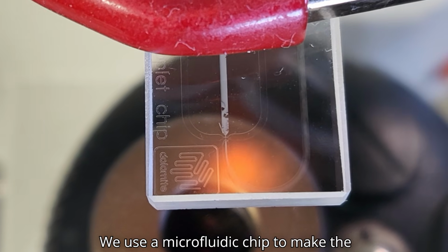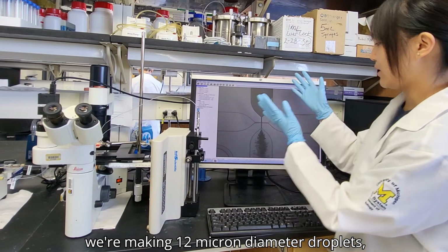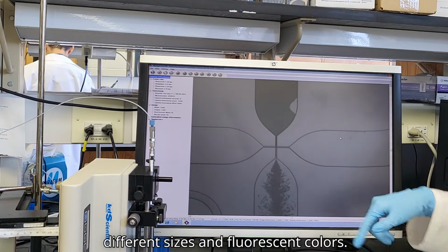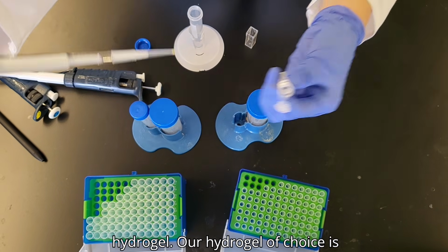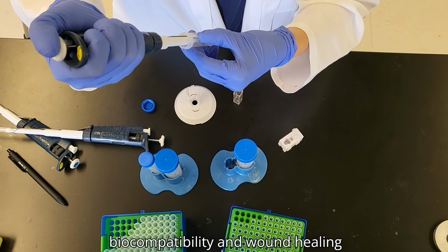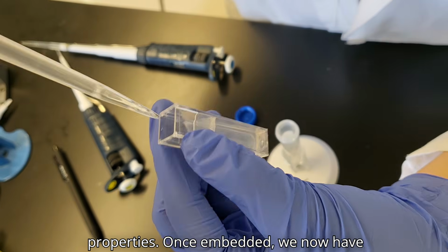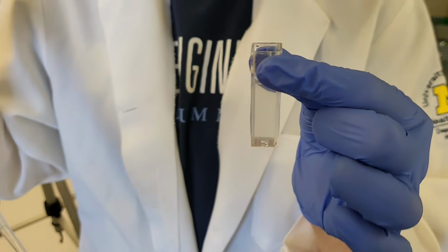Let's start with the droplets. We use a microfluidic chip to make the perfluorocarbon droplets. In this video, we're making 12 micron diameter droplets, but we can also make droplets of different sizes and fluorescent colors. We then embed these droplets into a hydrogel. Our hydrogel of choice is fibrin, which we use for its biocompatibility and wound healing properties. Once embedded, we now have our acoustically responsive scaffold, or ARS.